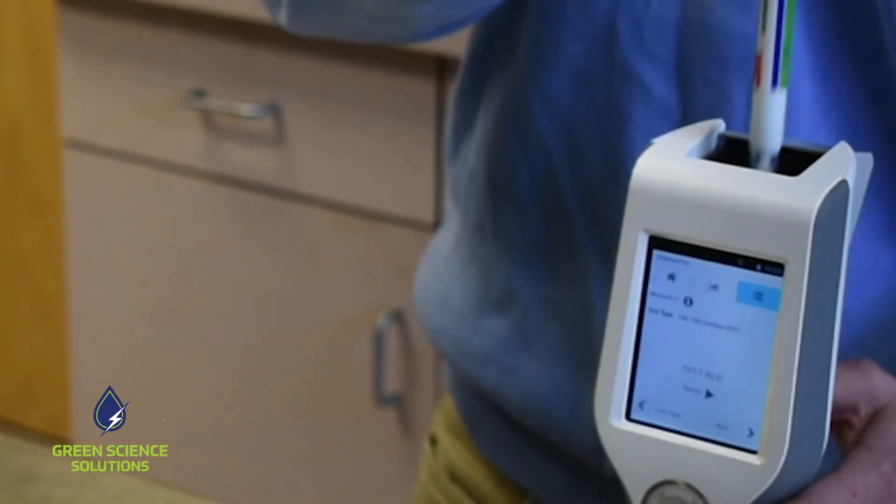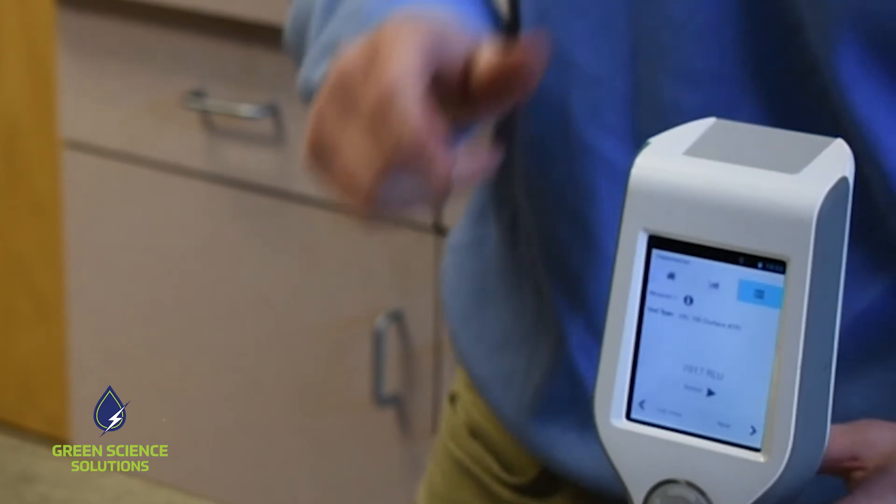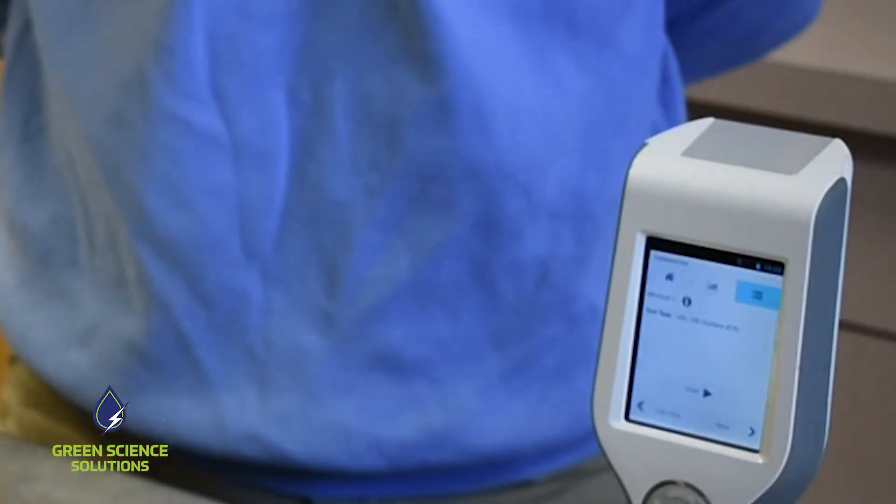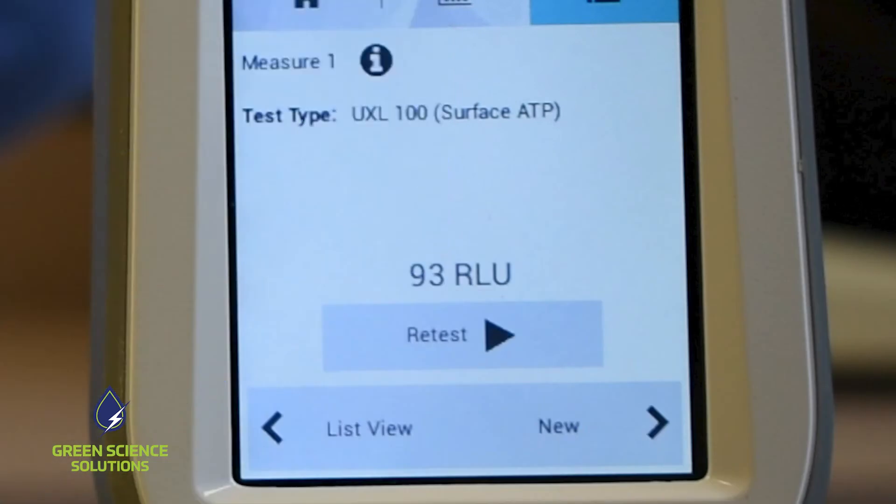The second swab and solution go into the LM1 and you'll get a new reading that will tell you how much dirt or ATP has been lifted off of that surface. And here's our new number.